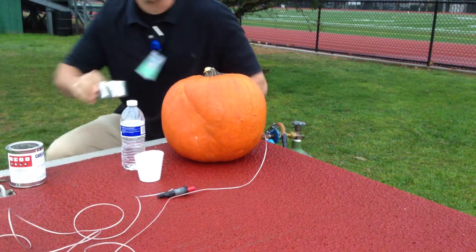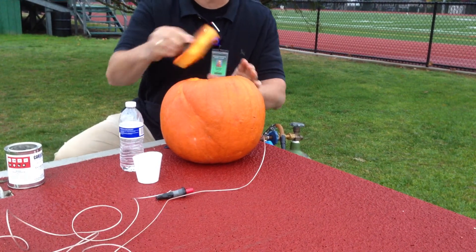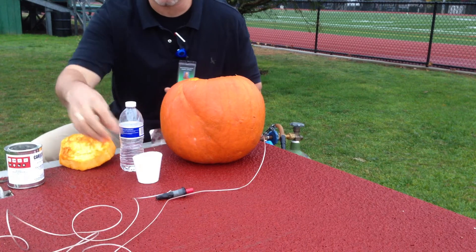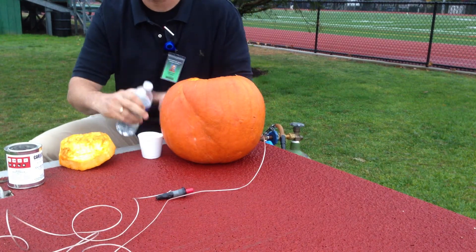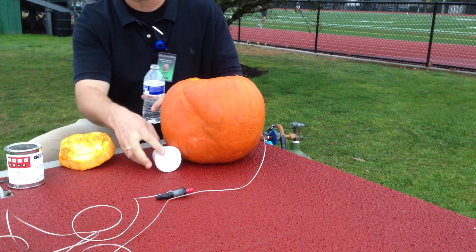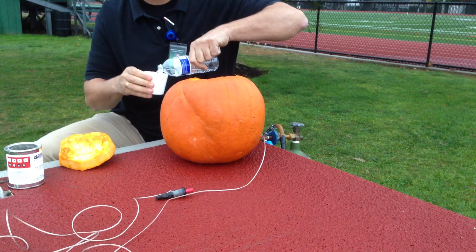Today we're reacting acetylene with some oxygen. I'm taking a nice pumpkin on my Halloween day here and I'm going to put in a little cup and fill that with some water. I'm here with a live studio audience so the pressure is on to do something spectacular.